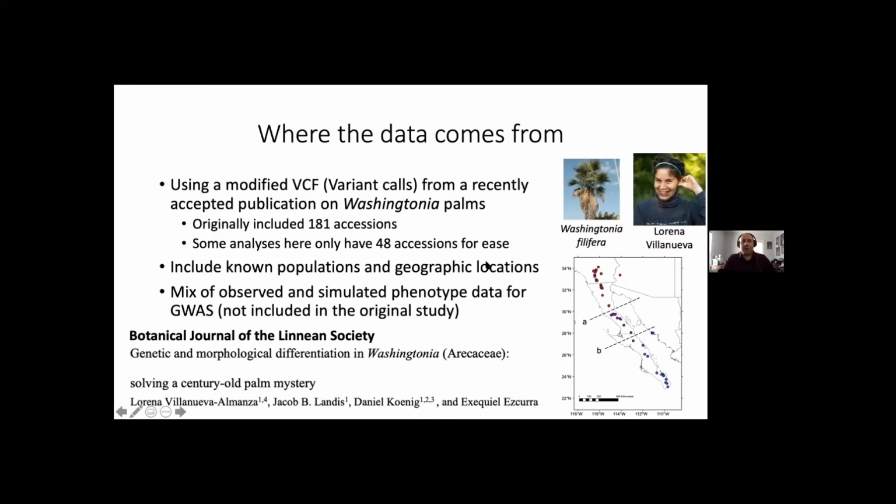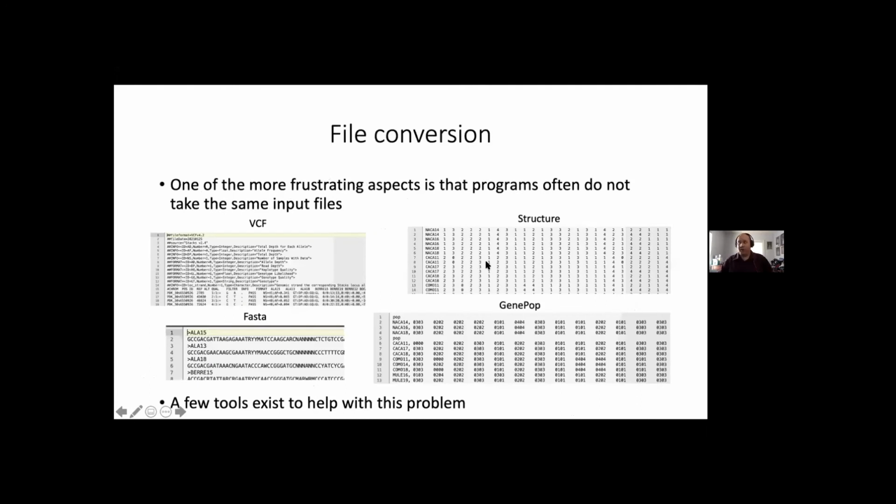So the first thing I want to cover is file conversion. And if you have done any of these analyses yourselves, you know that file conversion is a major pain. Most of these programs do not take the same input files, so you have to convert them from one format to another. Here are 4 examples I'm showing. This is all basically the same data, just in a different format.